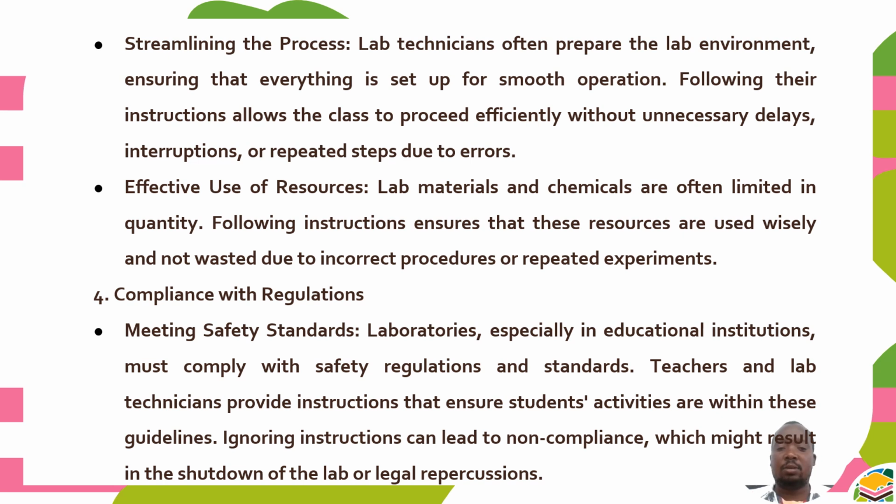Compliance with the regulations, meeting safety standards, because in the lab the safety standards are supposed to be met. So laboratories, especially in education institutions, must comply with safety regulations and standards. Teachers and lab technicians provide instructions that ensure students' activities are within these guidelines.